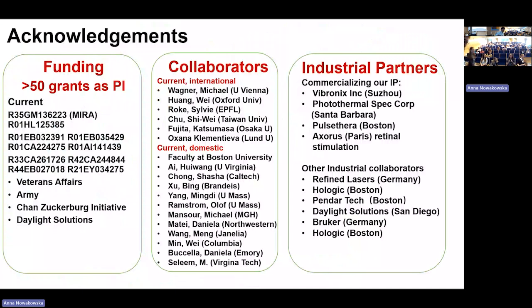The protein data, the protein data with the metasurface activity. So how do proteins absorb on those surfaces? Are you measuring adsorbed proteins or solution-based proteins? How do you distinguish those?